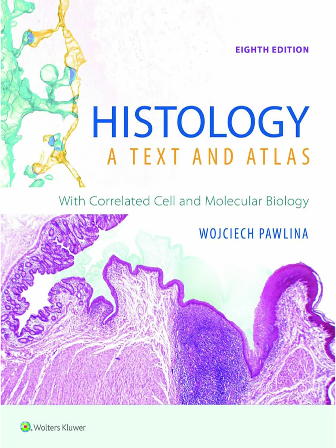How do we push deeper into histochemistry and cytochemistry to really understand the chemical makeup and maybe the function of cells? Now we're moving from just seeing shapes and colors to understanding the underlying chemistry and activity. That's histochemistry and cytochemistry. But first, it's important to realize what actually remains in a routine H&E section after all that processing. Right, because you said some things get lost.